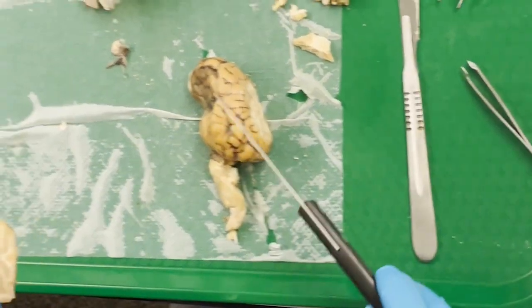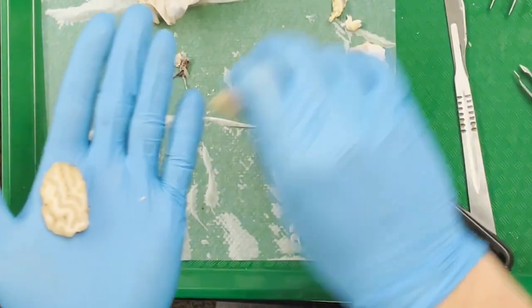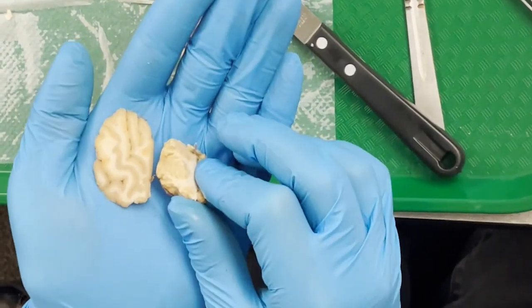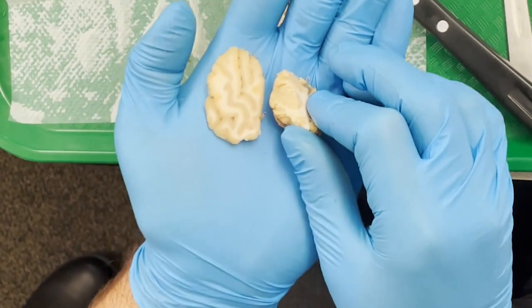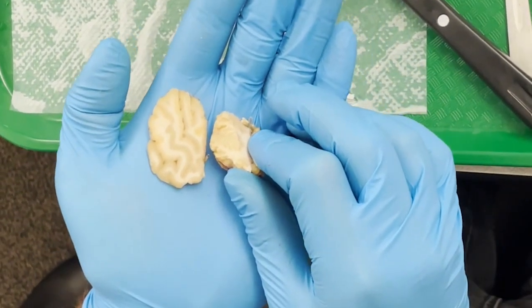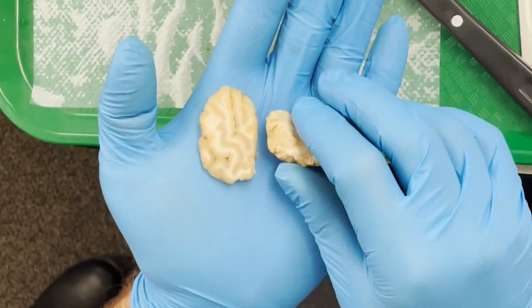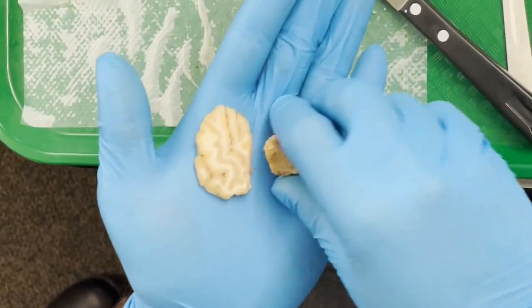So first, we see the inside of the cerebral cortex, and we can do a quick comparison versus the cerebellum. We see that the cerebellum has a lot more white matter tracts. It's a lot more convoluted, let's say. Has a lot more folds, a lot more divisions. And so this shows that the cerebellum is a much more dense brain mass compared to the cerebral cortex.